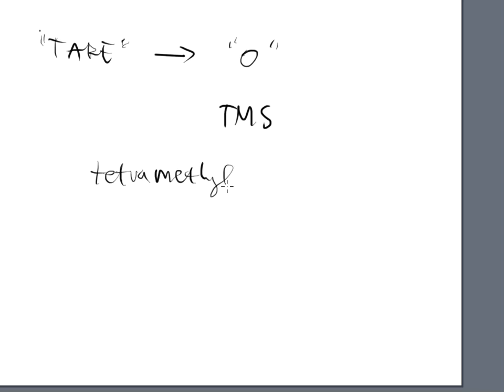As with many of the instruments out there in an analytical world, we have to have something to make this instrument read 0 in order to blank it. And what we use in the world of NMR is something called TMS, all right? The T stands for tetra, the M stands for methyl, and the S stands for silane. So, tetramethylsilane.